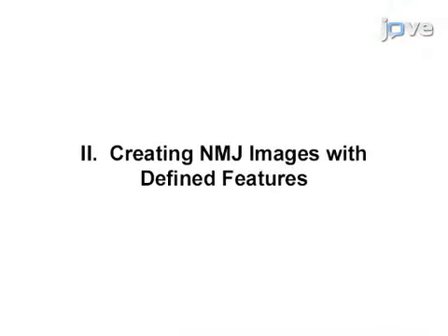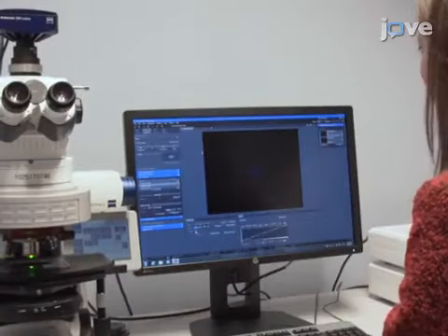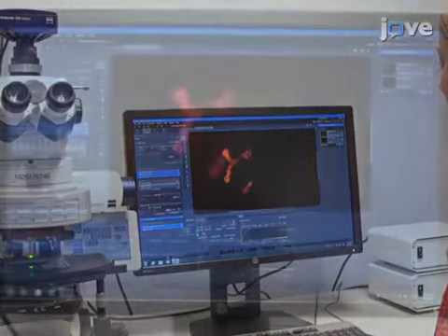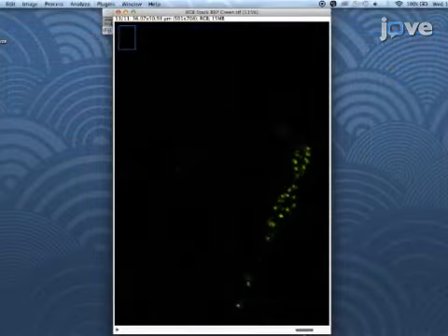Appropriate macro settings are crucial, and some steps might be difficult to new users, especially when not familiar with VG software. For this protocol, generate image stacks of NMJs and save them as individual TIFF files, where channel 1 shows DLG1 staining, or a similar marker, and channel 2 shows BRP staining.